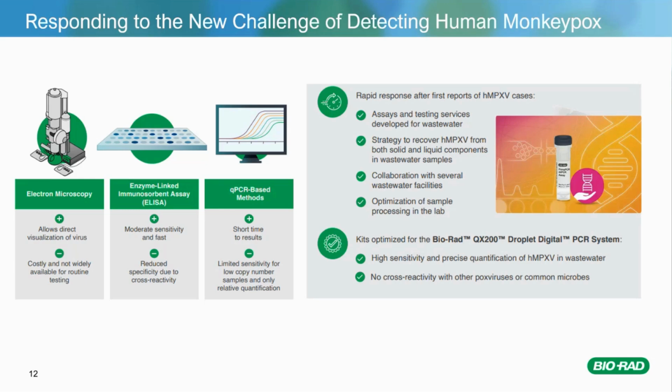So when we looked at the COVID pandemic, WBE proved, and continues to prove, effective for really good longitudinal detection and predicting of community surges for disease outbreak. In addition to getting around these other sample collection methods, ddPCR offers much higher sensitivity with absolute quantification methods. And this really helps provide much more actionable results for patients as well.